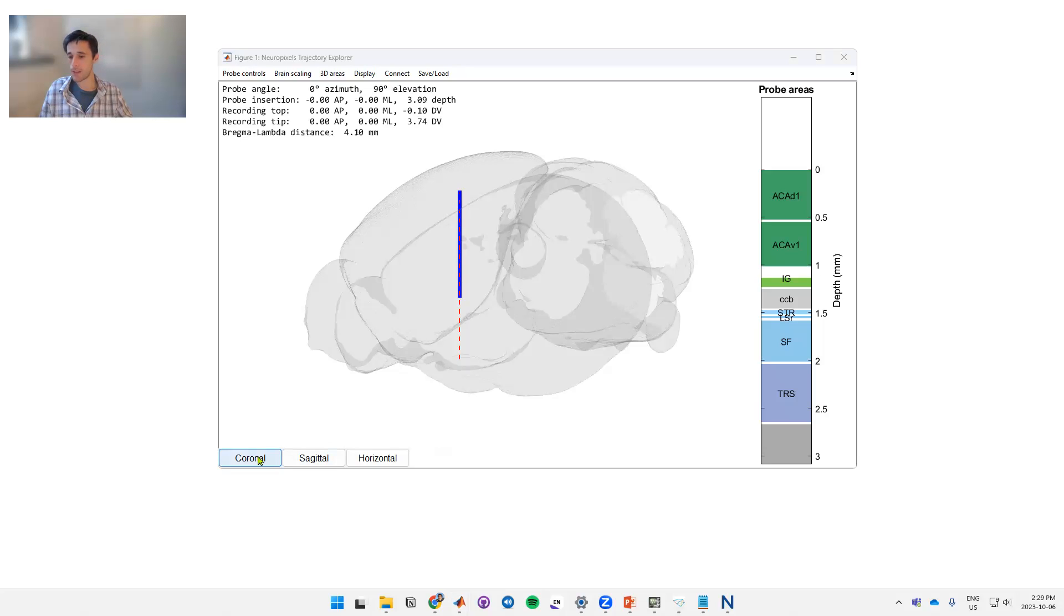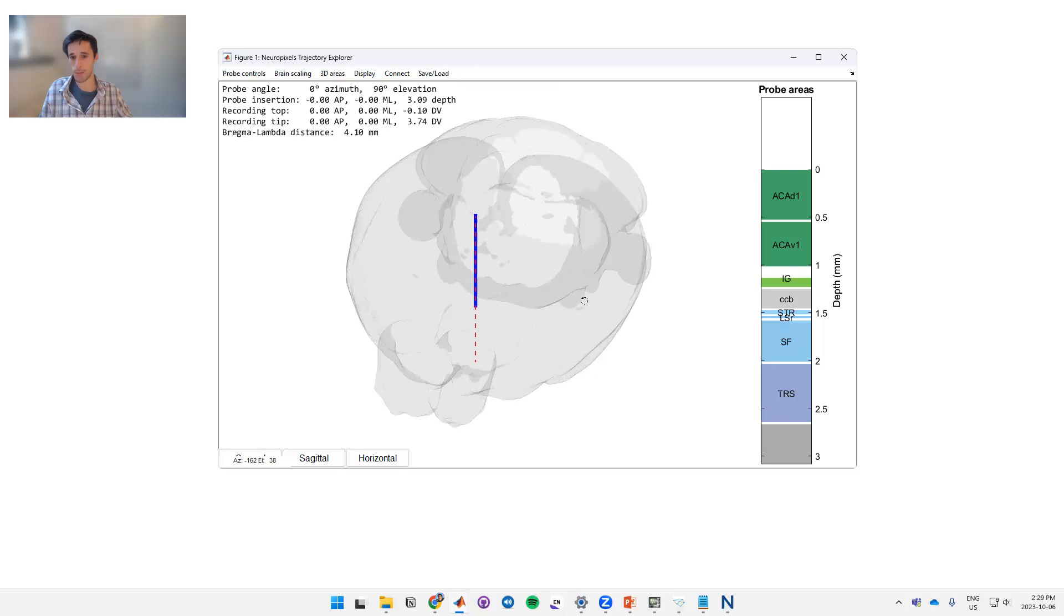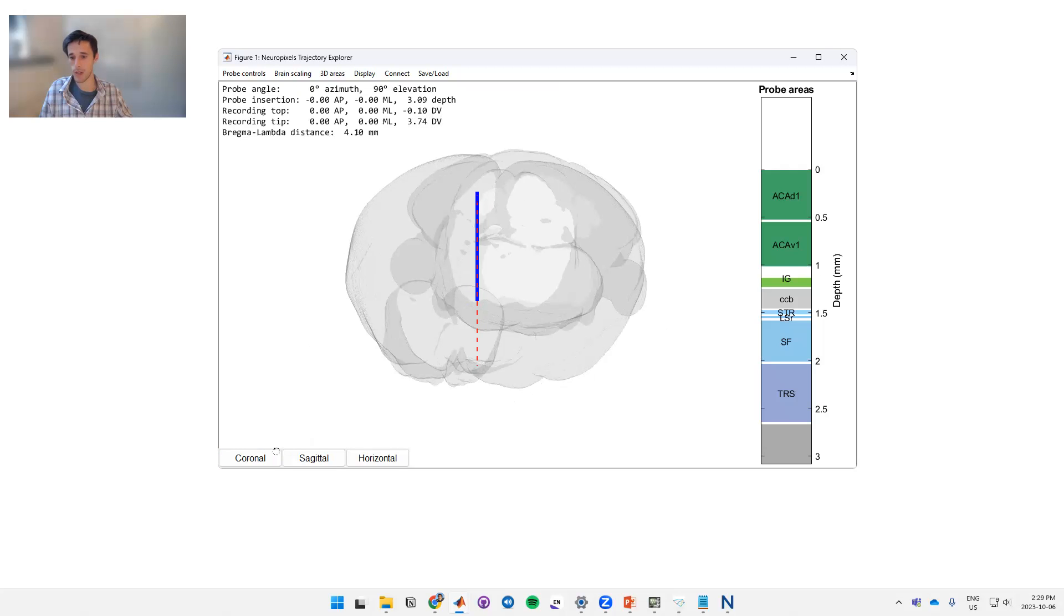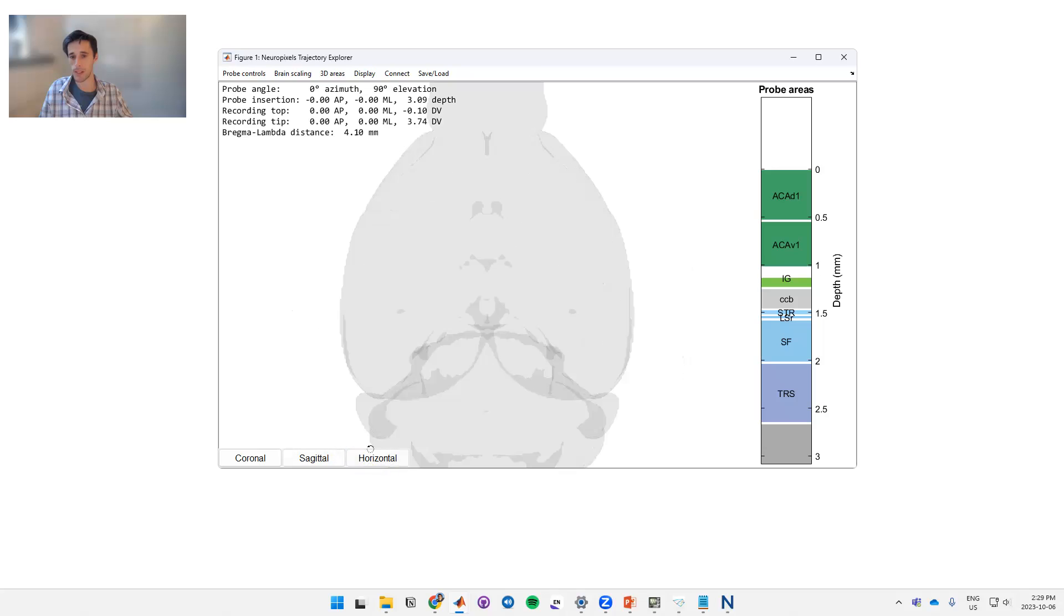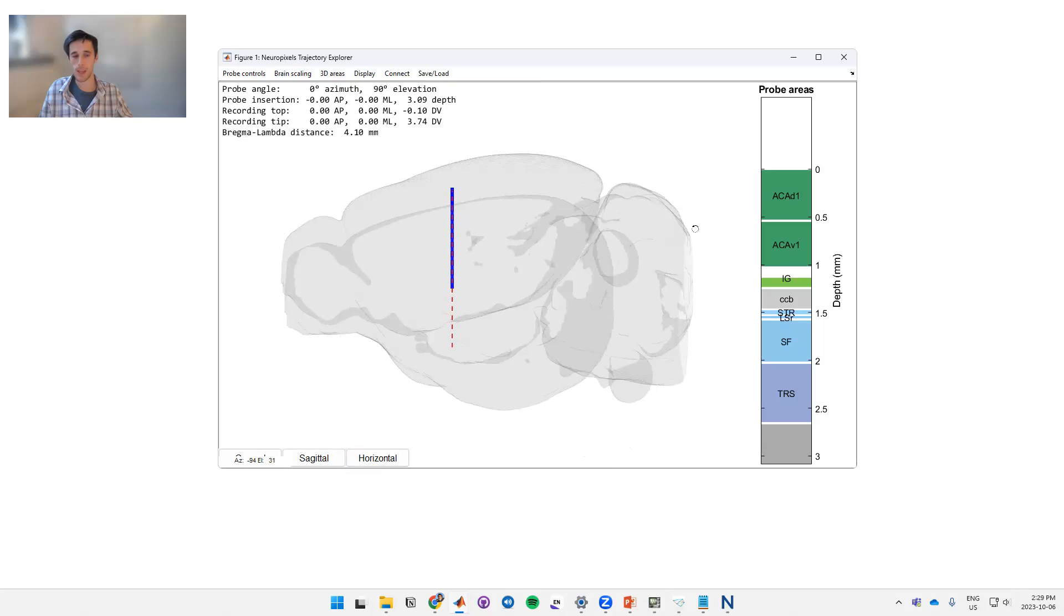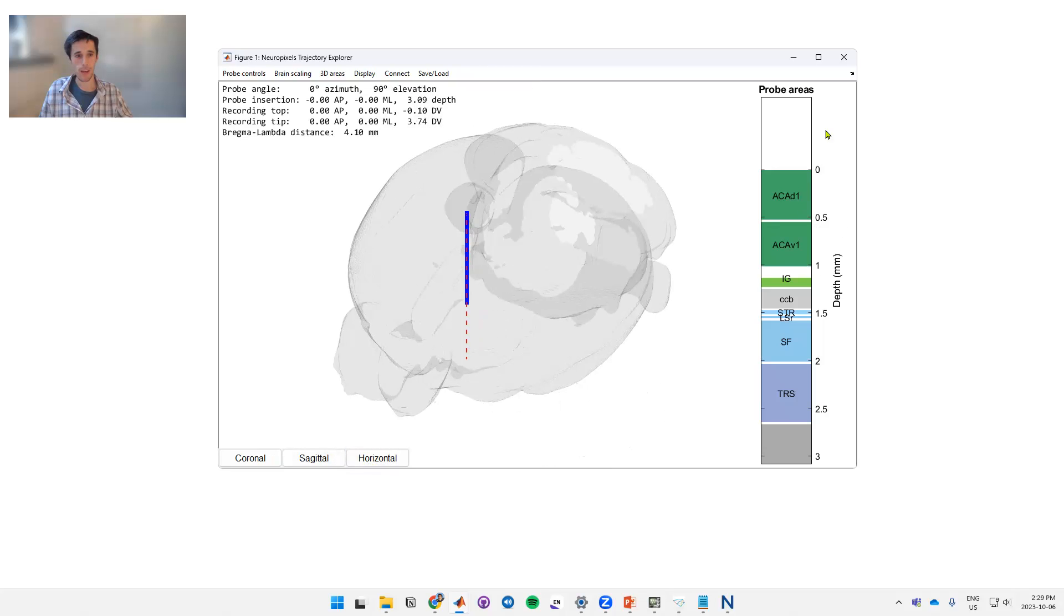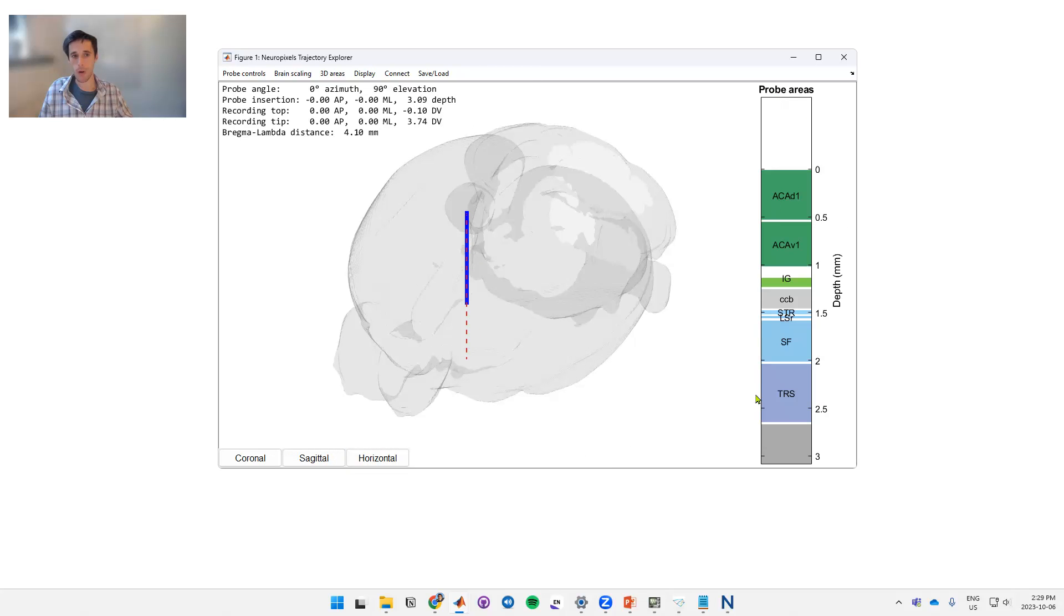On these bottom left buttons here you can change the perspective on the brain, so you can do this by clicking and moving the brain or you can hit these buttons to give you different perspectives. And on the right we've got the probe areas that this selected probe is going through.